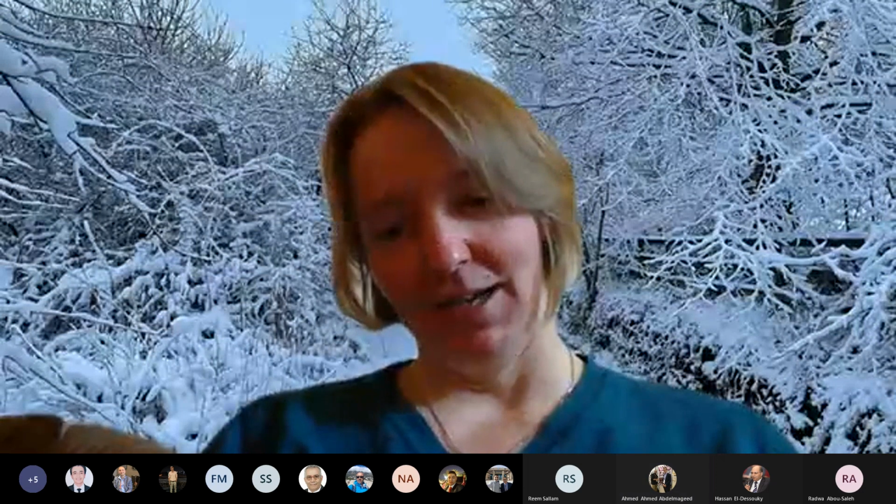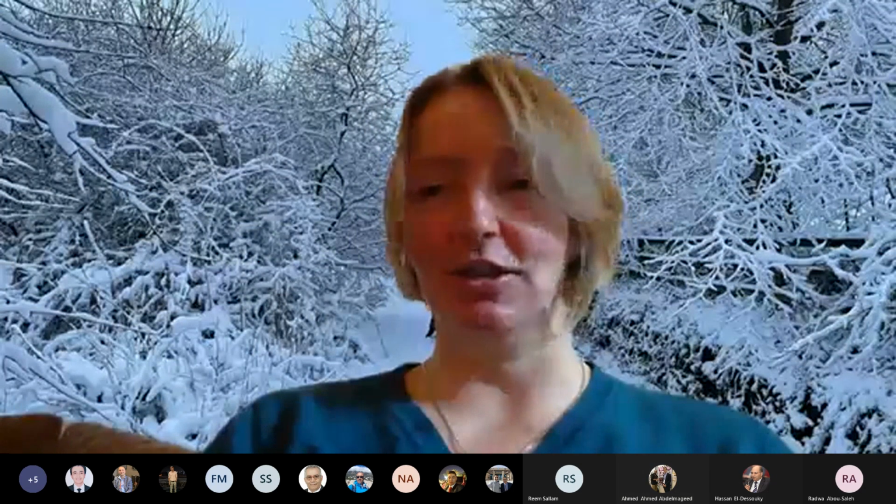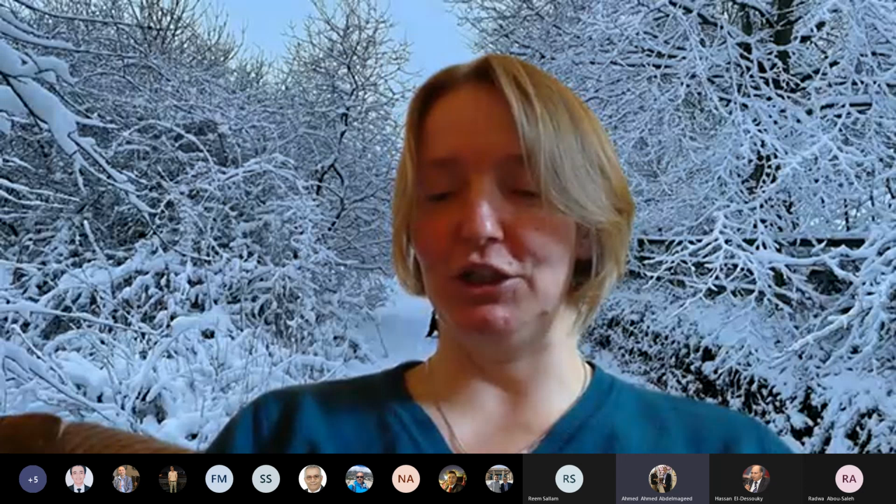Sal, I think you will like to answer question 1 a lot. You have been asked this one a lot, about the coalescence of cells, or sorry, of droplets. So yes, if you're using water in oil, then you have a high surface tension, and as soon as those droplets touch each other, they will coalesce. And the same is true for our bubbles. If we just used gas in water, there is extremely high surface tension and they are likely to coalesce when they touch each other.